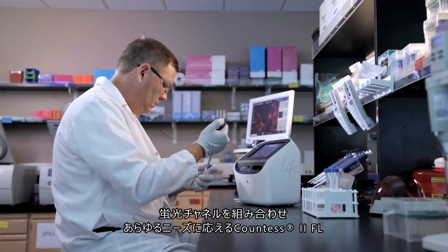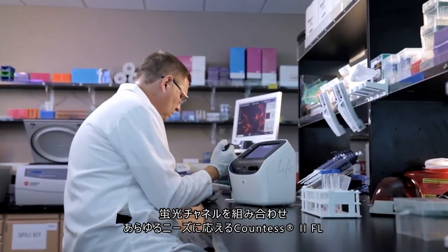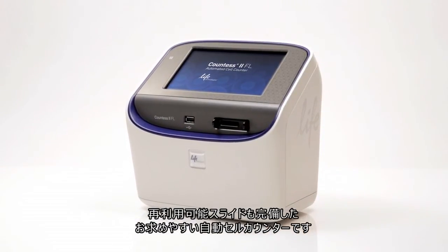The Countess2 FL automated cell counter is designed to adapt to your ever-changing cell counting needs. With two user-defined fluorescent channels and the option for a reusable slide, nothing counts like the Countess2 FL automated cell counter.